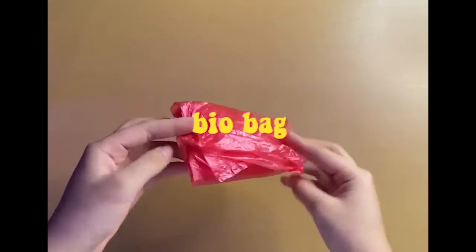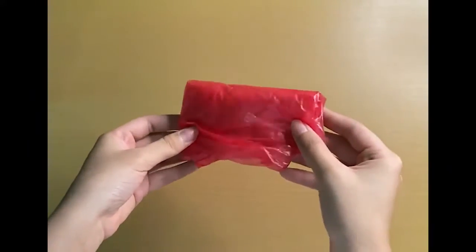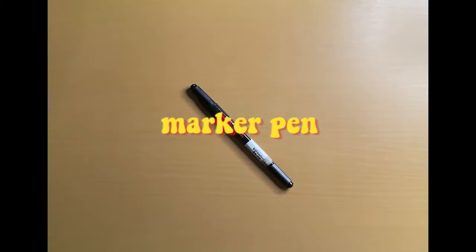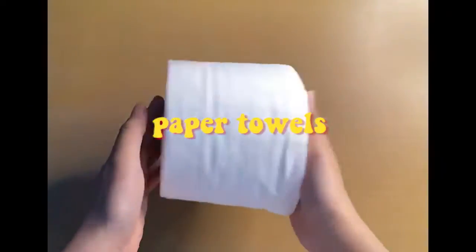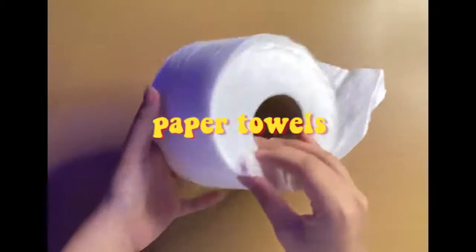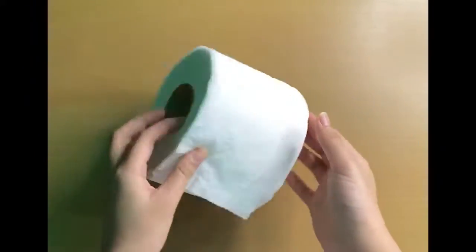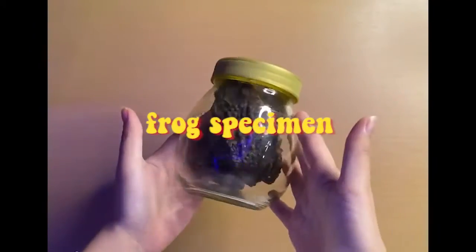Third, we have a biobag. This is where we will be disposing our wastes properly. Fourth, we need a marker pen to draw out our guides when making the incisions on the frog's skin. Fifth, we also need paper towels to aid us in cleaning our workspace. And lastly, we need our frog specimen for today's experiment.